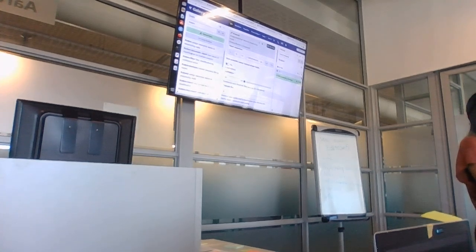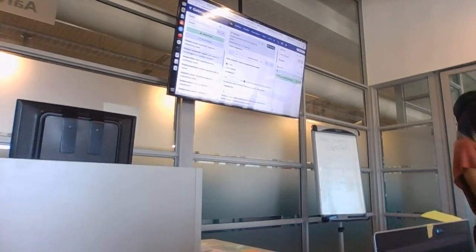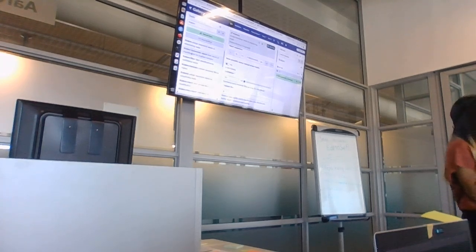There's a level of your own, well, I don't know if you can call it opinion, but you would suss it out based on your data. If you already have really bad quality reads and you don't want to lose most of it, you may use a different quality threshold than somebody else who already has good reads and wants to make it super squeaky, beautifully clean. So it's going to be like that.